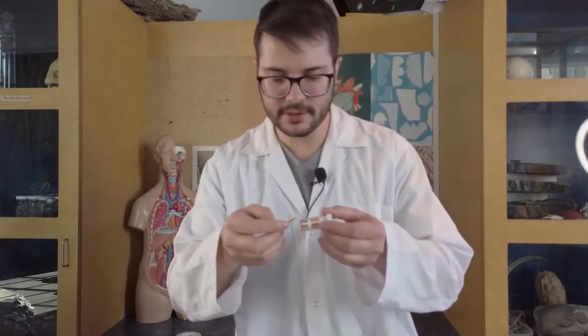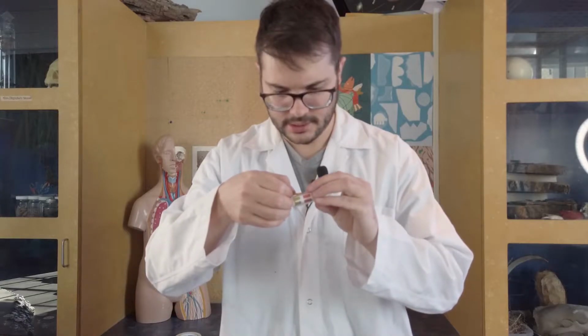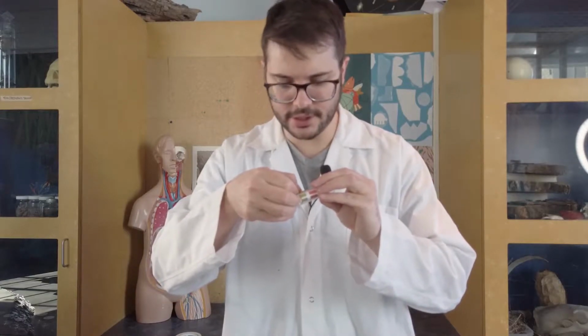All right, so now we've given it a little bit of time to work its magic. We're going to match it up against our container here. And wouldn't you know it, our soil out there has a pH of around 7. That pH of 7 is really important to the plants in Wascana Park, where all of our soil was gathered from. Other areas might have different acidities, and plants might grow better or worse in those areas based on that acidity.